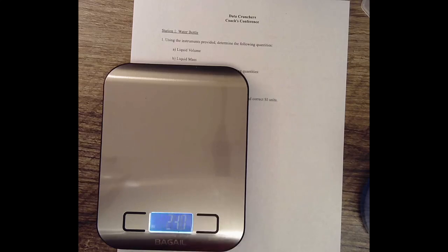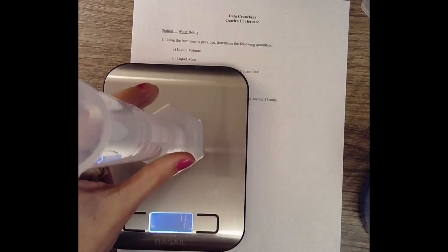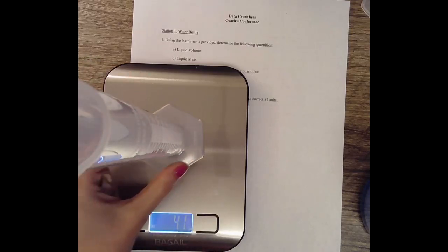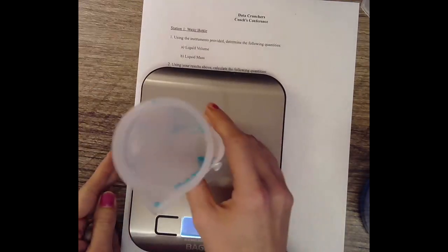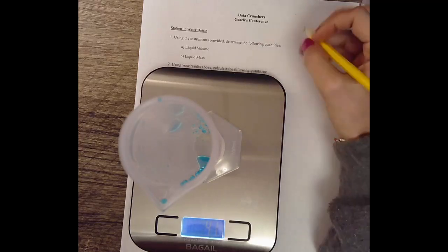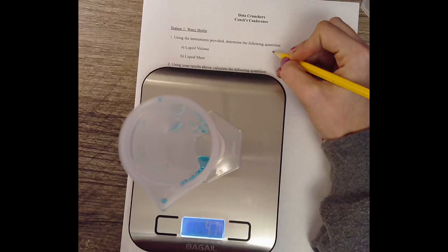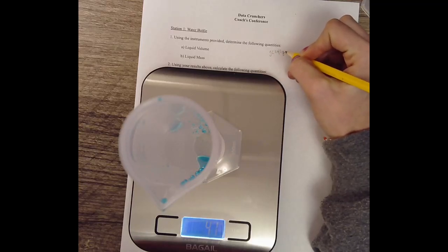Oh, I can do milliliters actually. That's kind of cool. So we can do milliliters and grams. That's awesome. We're going to put our scale on, our graduated cylinder on, right there for you guys. Let me move this over. You're going to want to always set your stuff in the middle of your scale, not on the side. And don't have your hands on the table whenever you are measuring something. It's 41 grams. Your graduated cylinder is 41 grams.